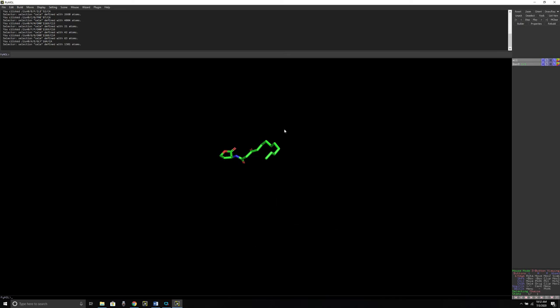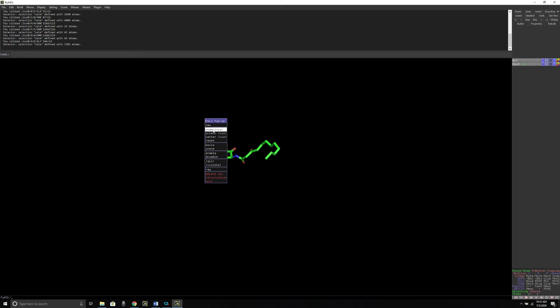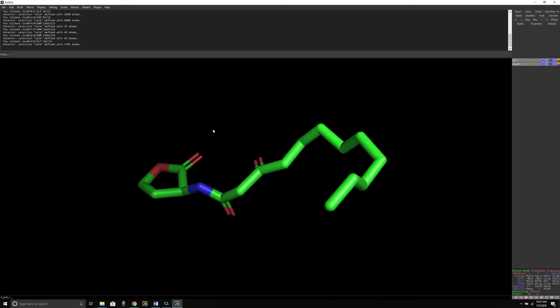Everything is deleted. You can also again zoom vis and see the ligand molecule closely.